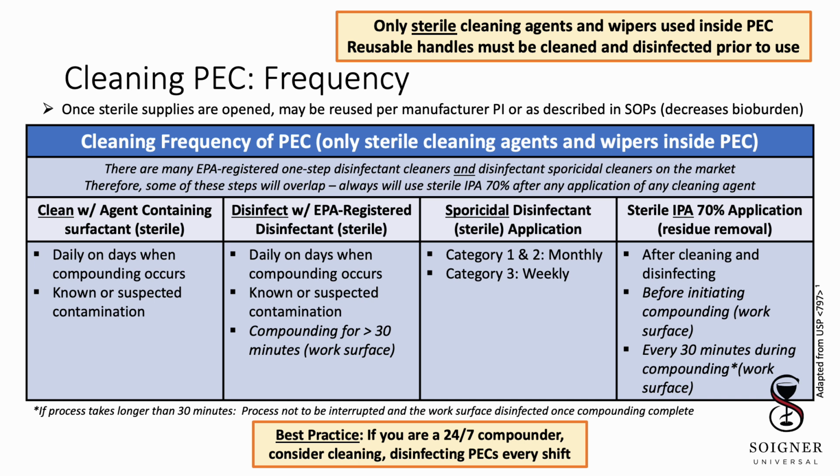IPA will also be used on the work surface prior to initiating compounding and every 30 minutes during the compounding process. However, if compounding takes longer than 30 minutes, compounding will not be interrupted, but instead, once compounding is finished, the work surface will be disinfected, followed by IPA to remove residues.